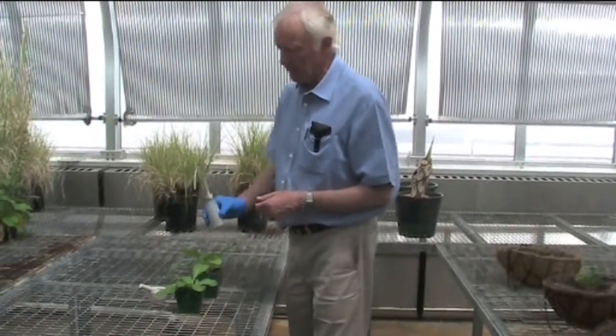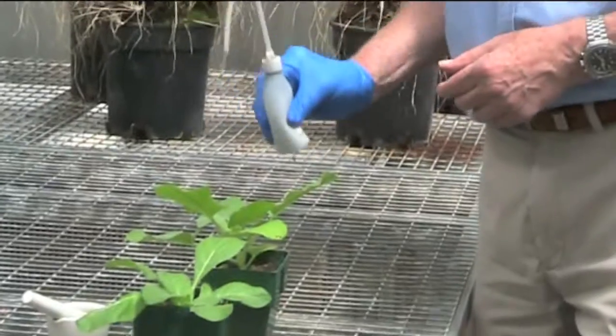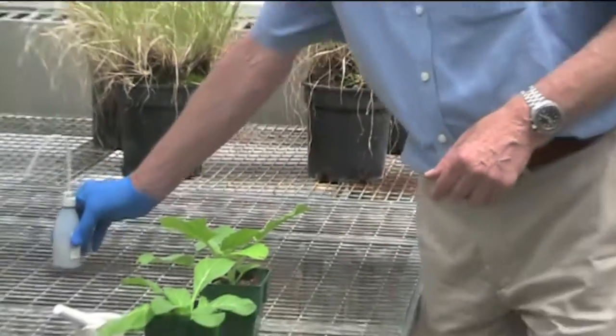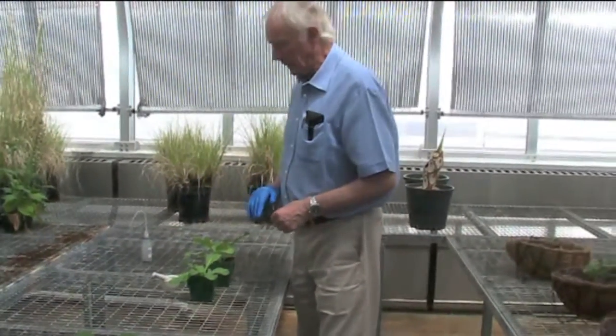We use a very finely ground carborundum powder, which is applied like this. So there's a very light coating of this very finely ground carborundum.